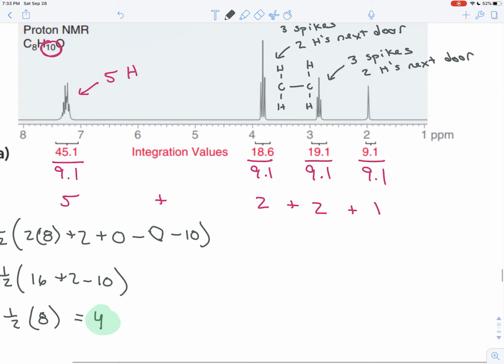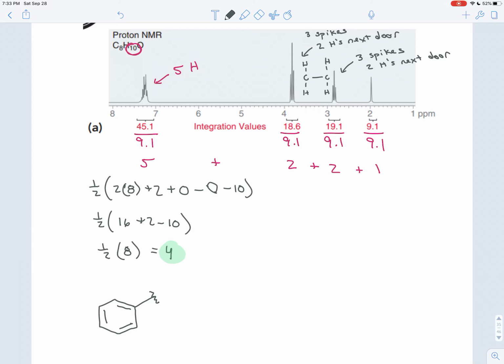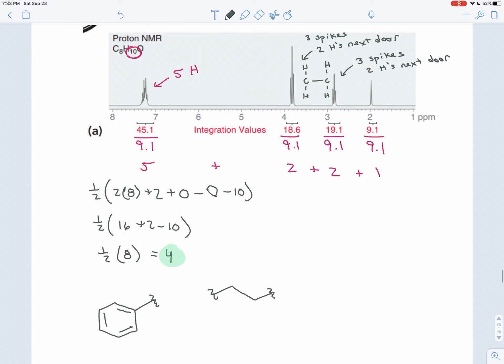So now we know that that is another piece of our puzzle, representing those 2 peaks are 2 CH2s. So here's 1 CH2, and here's our other CH2. The 2 hydrogens on each, and the splitting pattern. If these hydrogens have only 2 hydrogens next door, then they split into a triplet, and that's what we saw, and same for the other one.